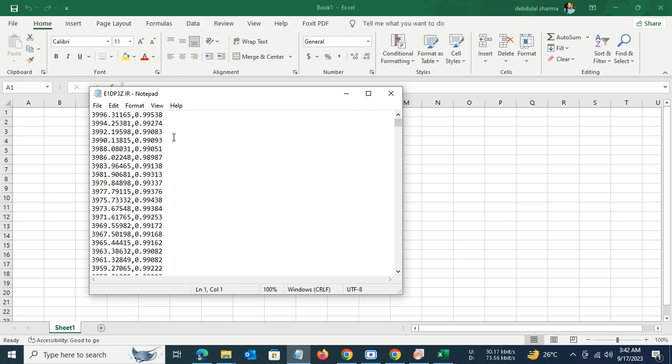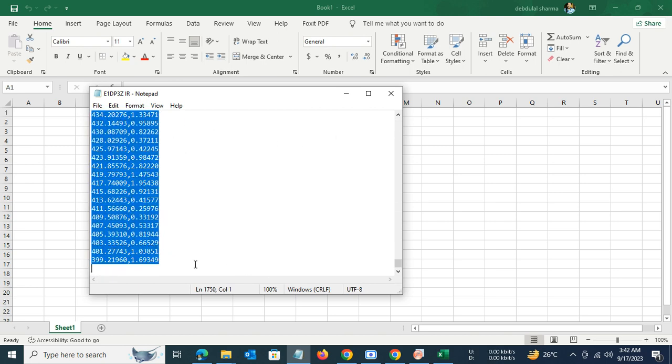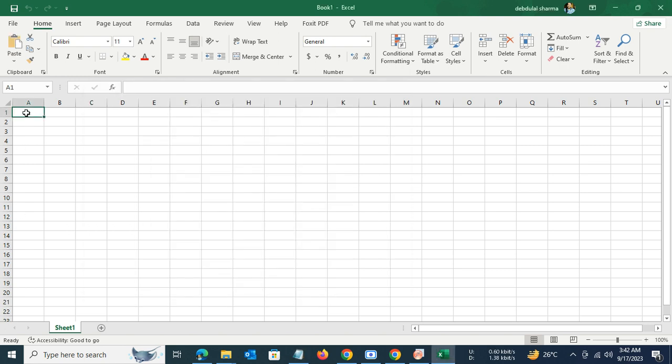For that purpose, let us select the entire data set, copy it, and paste it in an appropriate column in the Excel sheet.